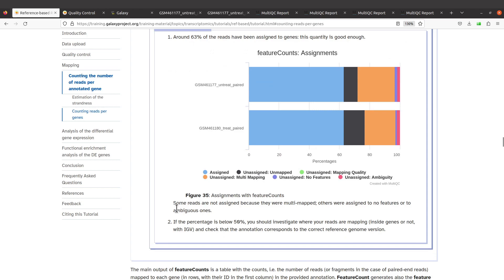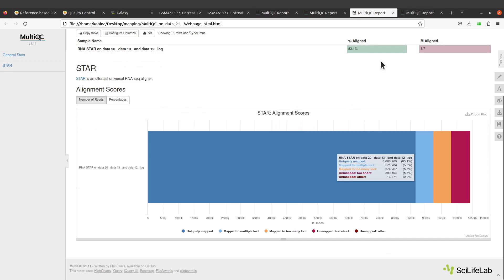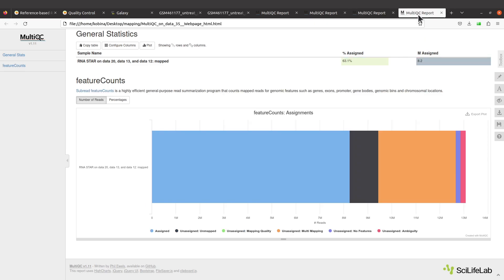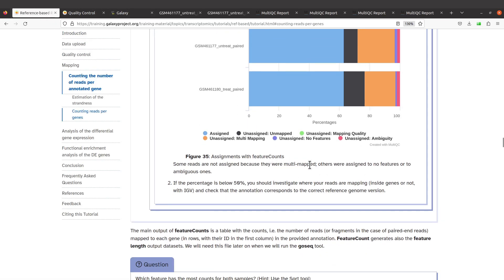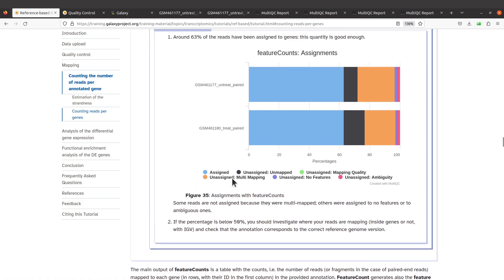There's also an important point raised here: some reads are not assigned because they were multi-mapped, while others were assigned to no features or to ambiguous ones. If we look at our mapping statistics — the STAR mapping statistics — we see uniquely mapped reads, reads mapped to multiple loci, etc. Those multi-mapped reads and reads assigned to no features are the ones not being assigned. The statistics are useful because they help you examine the outputs and decide if the result is good enough to proceed with the downstream analysis.